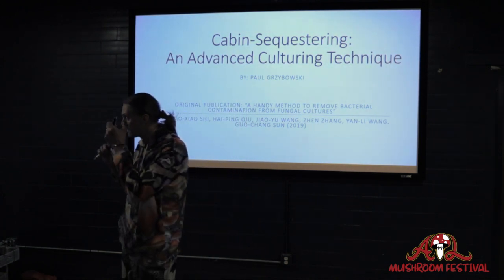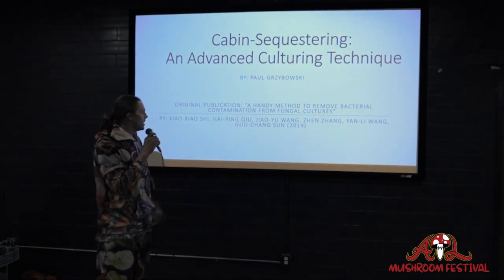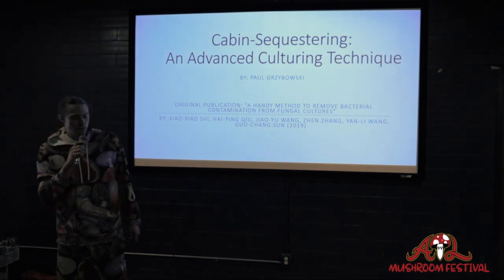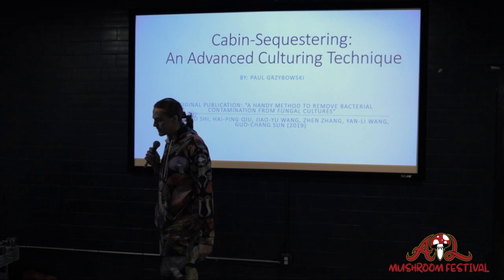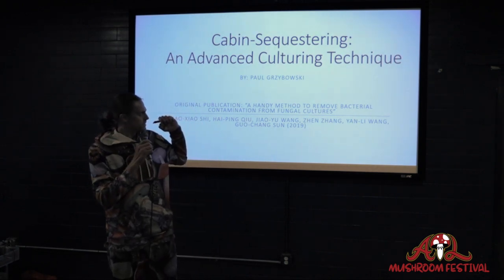Okay, so my talk's about cabin sequestering. The original publication was "A handy method to remove bacterial contamination from fungal cultures" by Xiao et al. And I'm super excited to give this presentation to you so you can learn more about this technique.